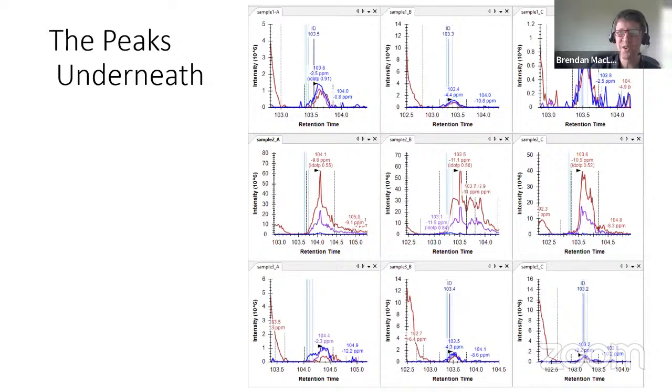And so here are the chromatogram plots, just displayed as Skyline would display them, very easy to look at. We can get a lot of information just here, and this is probably as low as we're going to go in this case. We can see that we have IDs in the middle of this for 5 runs: 3 of the sample 1 and 2 of the sample 3. Here's one that's not ID'd, but it looks very similar to the others, and we can see from the alignment that these bluish lines, we're picking basically the same peak, not a problem there.